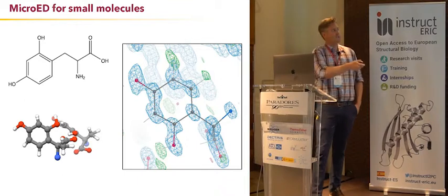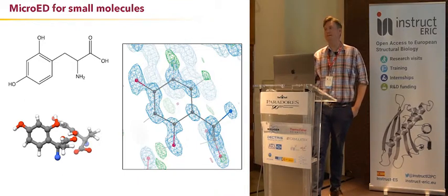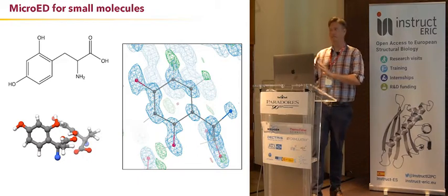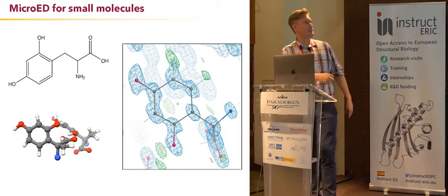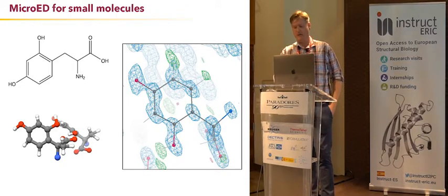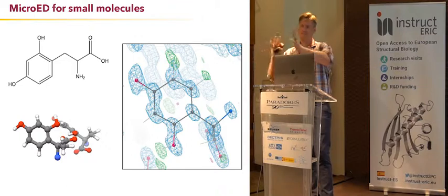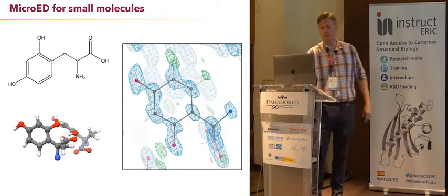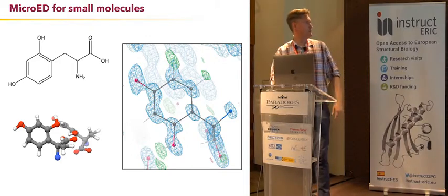And again, we collected data. It took about 30 minutes to collect the data, about 10 minutes to sort of solve the structure, and then we could kind of solve the fight between the NMR people and the synthesis people that, yeah, you did make some weird compound. So they're actually in the process of figuring out how is that possible. They think that maybe something happened where the reaction is actually happening outside of the enzyme. But here's sort of the molecule.